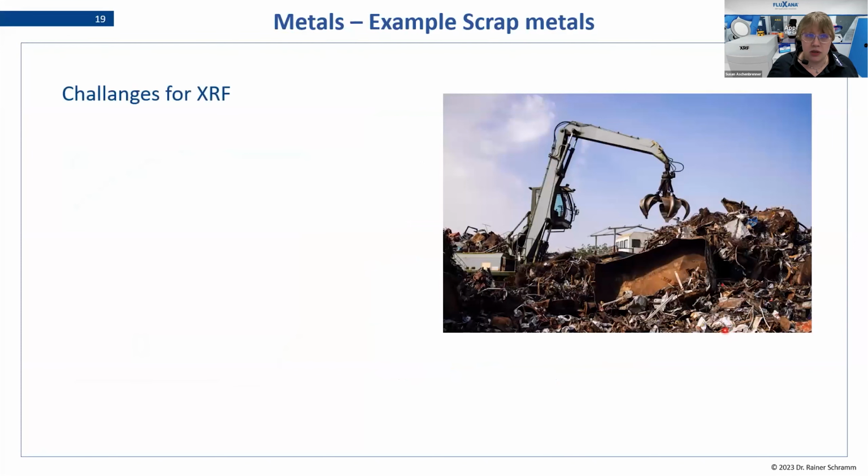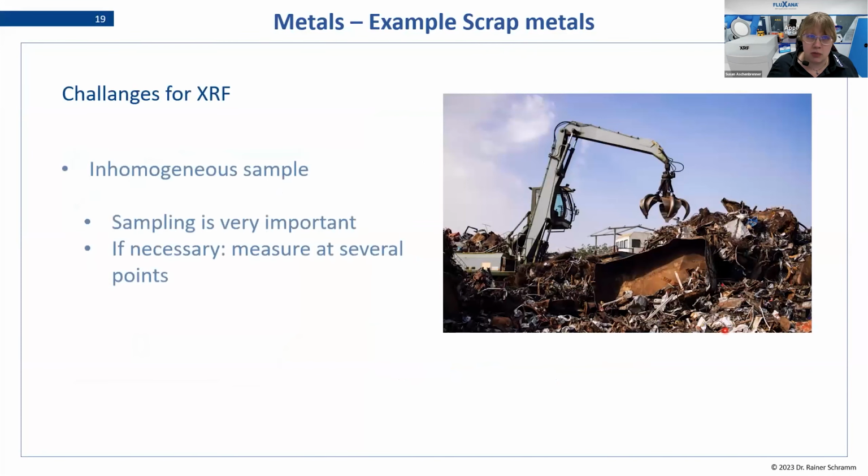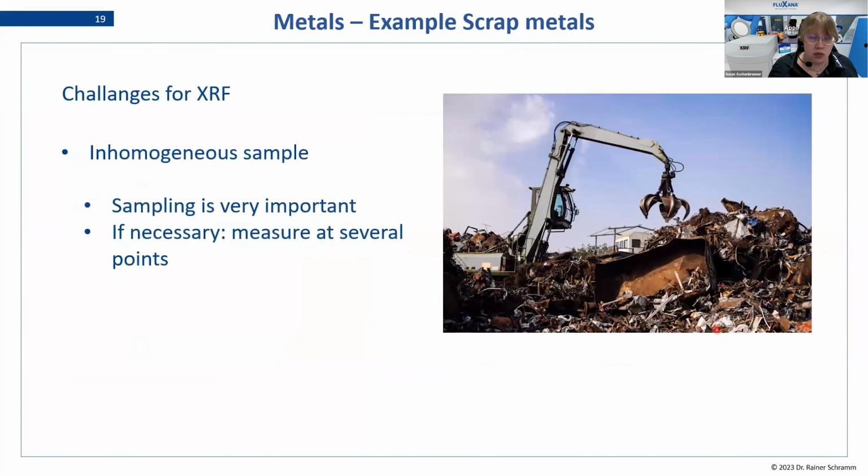What are the challenges for our XRF measurement? Again, inhomogeneous samples. Again, the sampling is very important in this case. Maybe several points have to be measured. Different points of the batch of the samples have to be measured. And again, we have to be aware that our sample might not be representative for the whole batch.